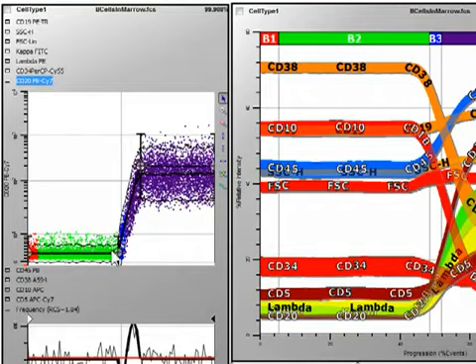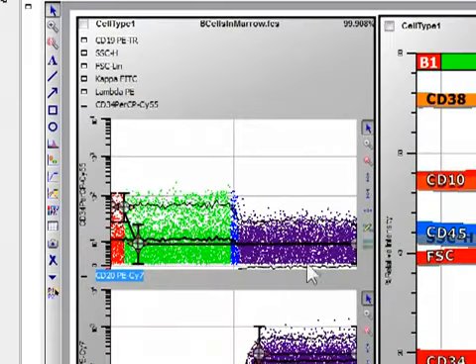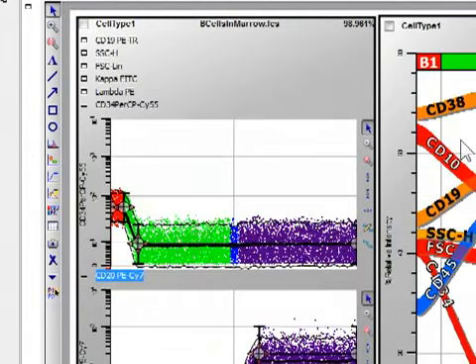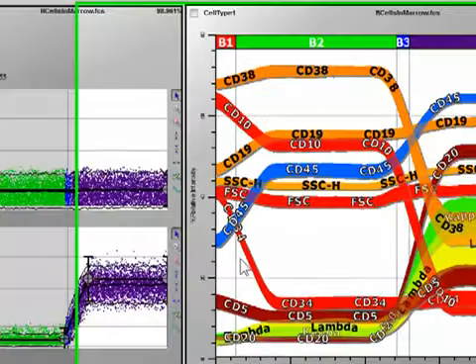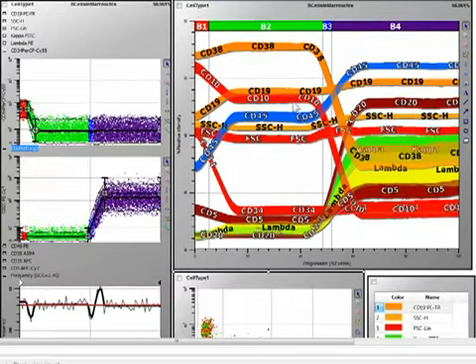It is. Let's now look at what Sam probably did next, where he looked at CD34, and he knew that CD34 is downregulated early on, and he used a step down, and as soon as he hit the estimate button, he could see the rest of the correlations in the plot. So do we need to model the remaining parameters, or are we all set at this point? We're pretty much all set.